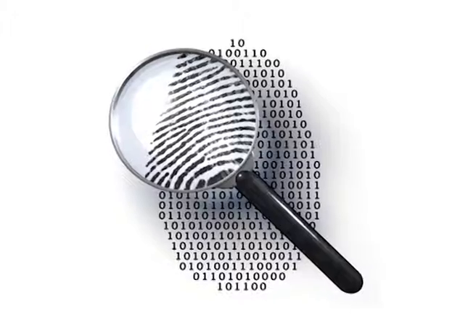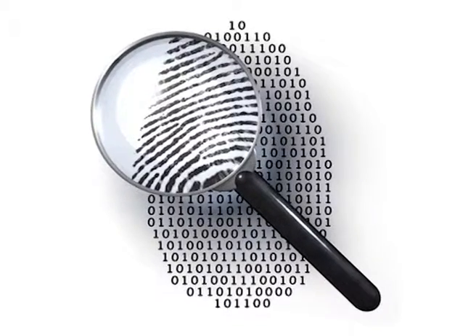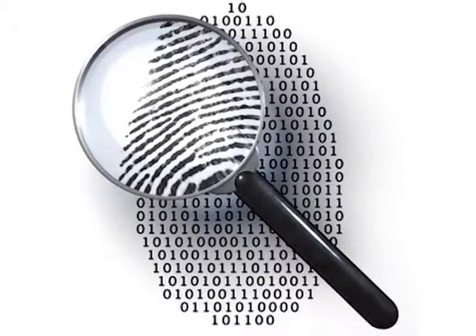A scrutiny of these items may also reveal bloody fingerprints. Such fingerprints are generally visible since the ridges become stained with the red color of blood. The image here shows how blood impressions are usually discernible.